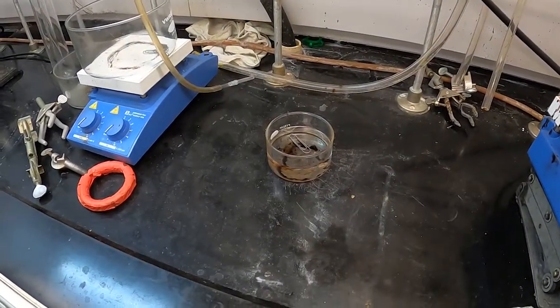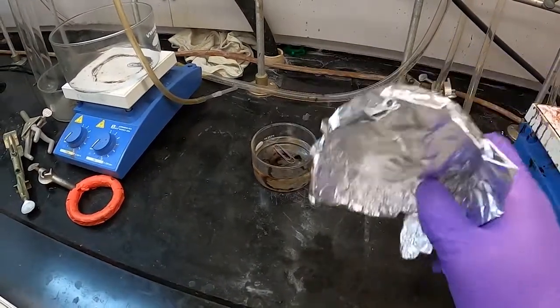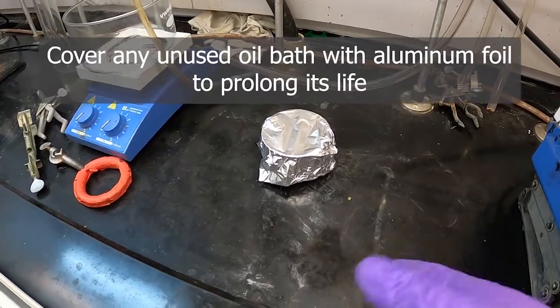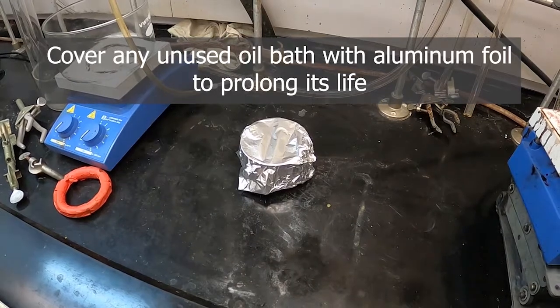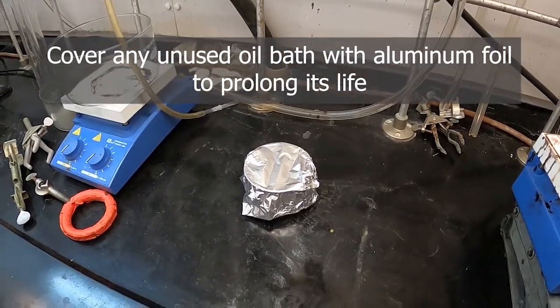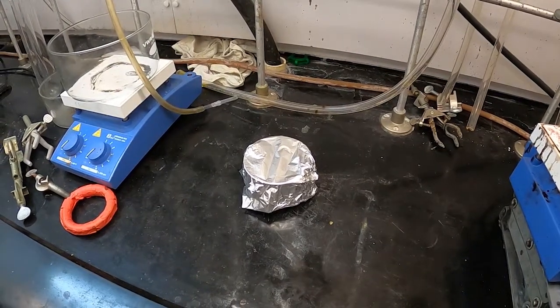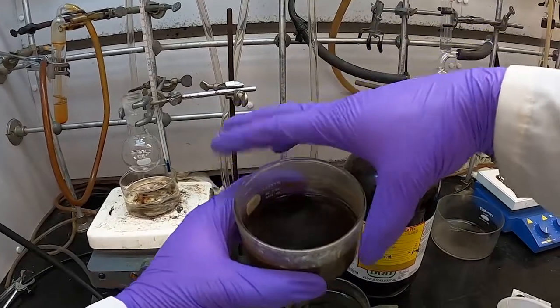When we're not using an oil bath, we can set it aside off of our hot plate and just make a simple cover out of aluminum foil to cover it. That will keep dust and other things out of it so that it stays good for as long as possible. We don't have to replace that oil provided we don't heat too hot.